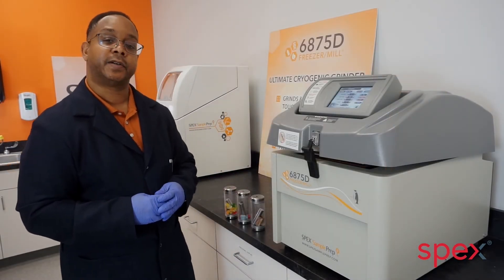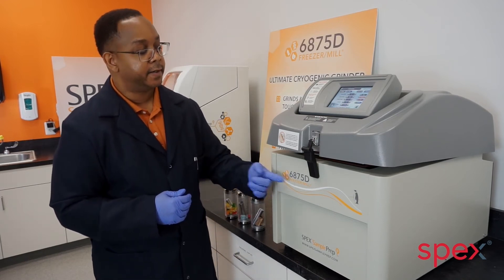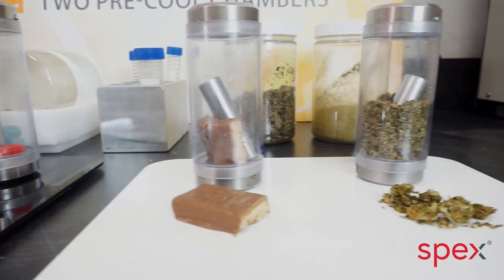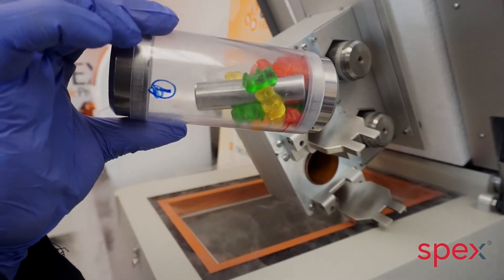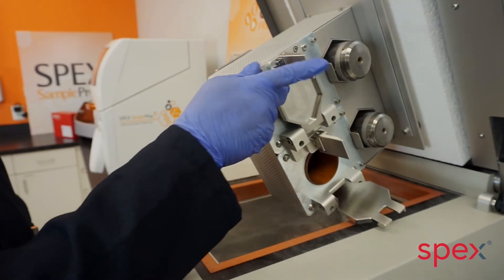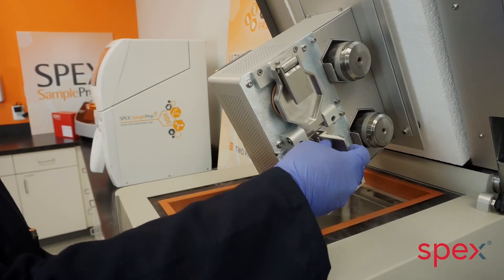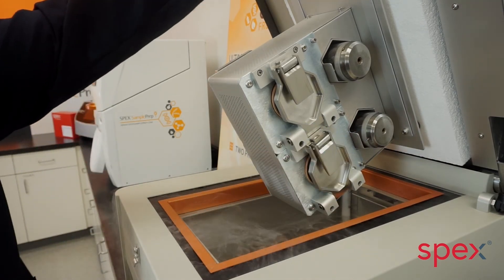The freezer mill uses liquid nitrogen to embrittle the sample while crushing it to a powder. The 6875D is fully programmable with a touchscreen interface. The sample vials are loaded into the grinding chamber, with a typical run time of seven to ten minutes.